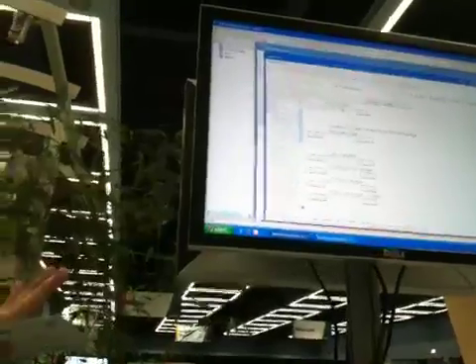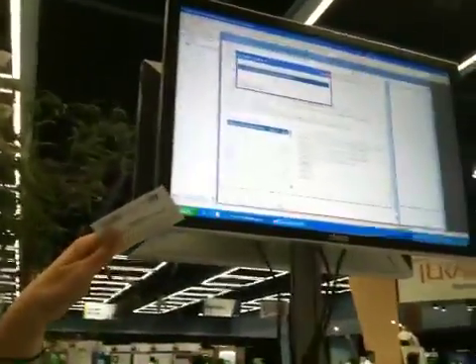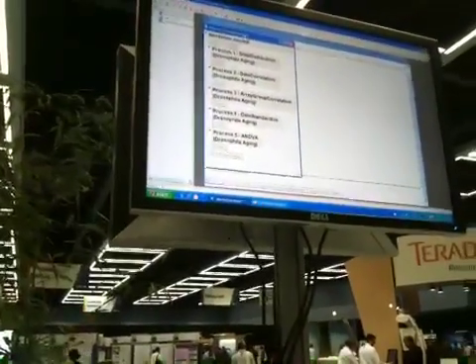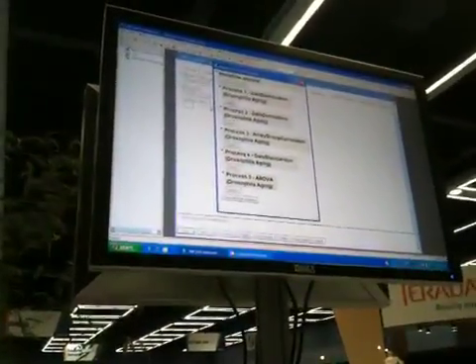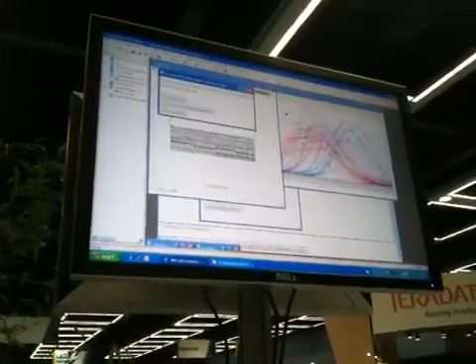And this is the last step. We've done our QC and normalization, and now we're loading up our ANOVA platform, and that's connecting to SAS in the background and running that to test for gene expression differences in our data. Now here's our results, so we can see all the processes we did. And each time we click on the button, it'll give us the results of that process. This first one was just a quality control to look at our data.